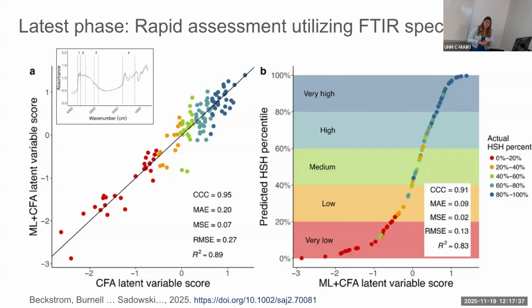And so we have a project where we're looking at FTIR and saying, okay, well, we can perform measurements more quickly and cost effectively if we were to scan the soil. So here you can see, okay, you come up with spectra. And then what we've done is we've worked with a couple of students, and Peter Sadowski talked last week, is that right? Or last seminar.